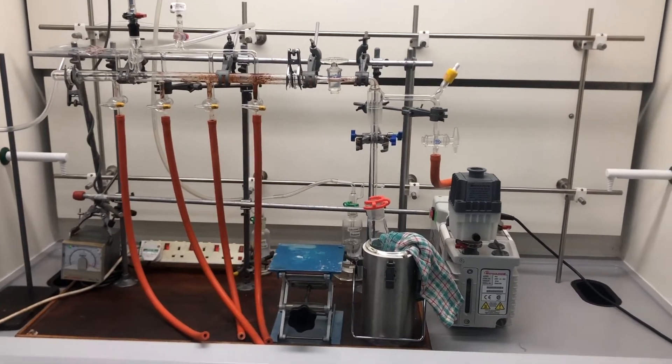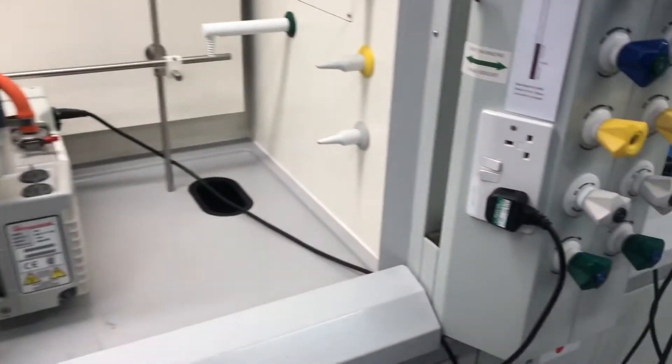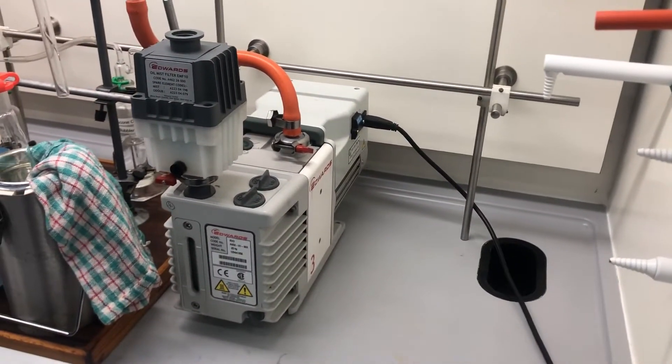Here's what it looks like in the fume hood. It can look a bit daunting, but when we break it down into its different parts, it's fairly simple.